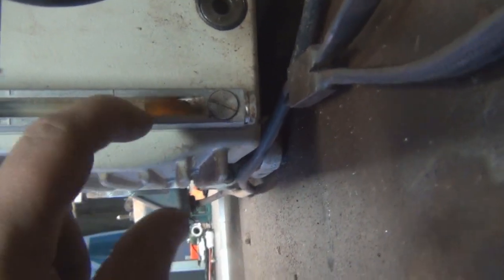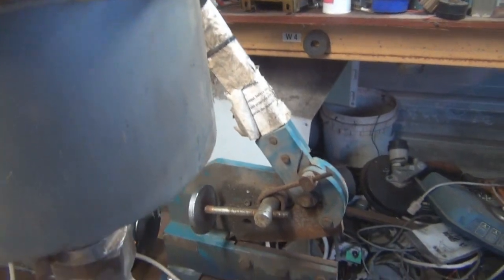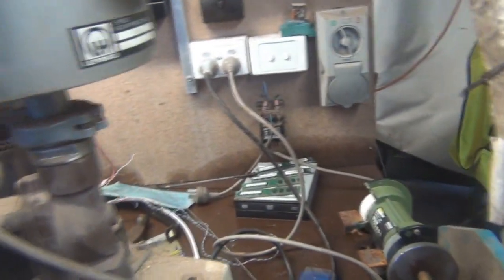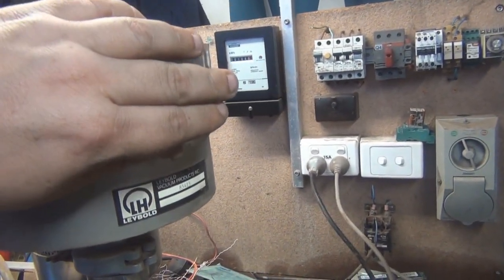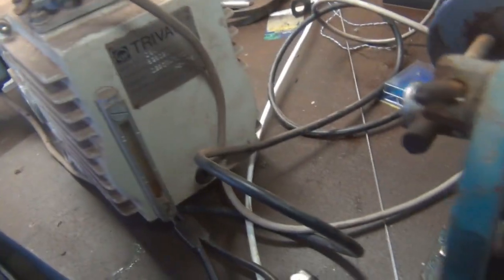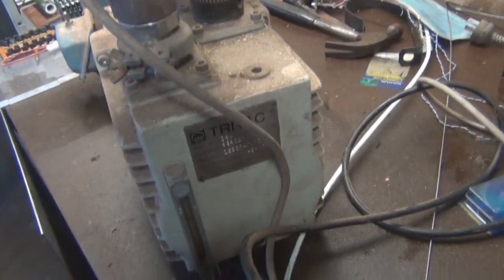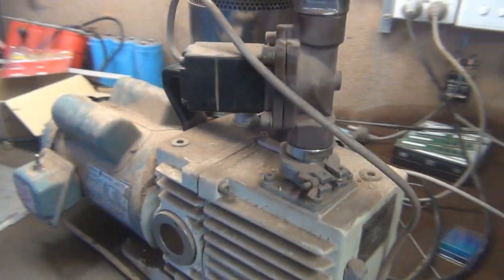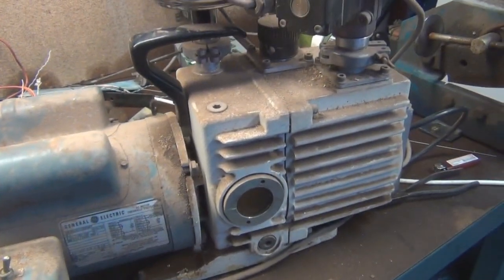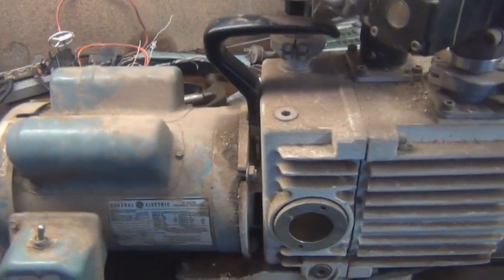It doesn't have much oil in it — it's pretty much at the low mark, or below. So I don't really want to run it too much, but we'll turn on the solenoid. Click — that's opened up the passage in there. Oh yeah, it's got a stiff vacuum, alright. That's a lot better than any fridge compressor I've ever played with. Like I said, I don't want to run it because there's not much oil — I don't want to damage it. I'm going to have to find some oil. It says HE175 oil. I wonder if there's an equivalent I can use or if I have to get it from a lab supplier, or maybe from a refrigerant supplier — maybe they have vacuum oil at a fridgy shop.